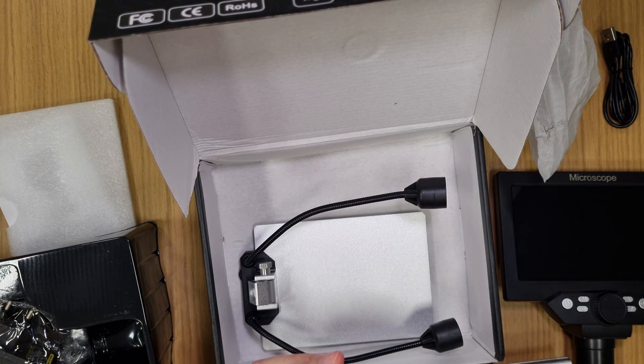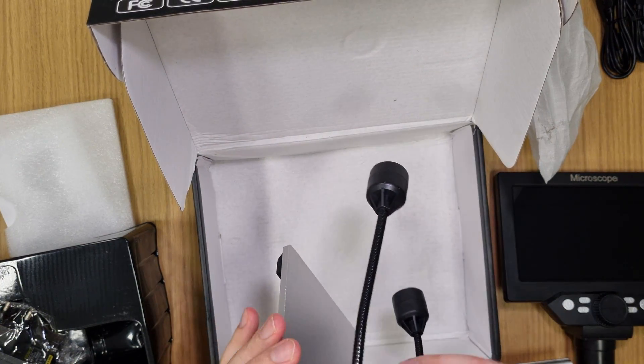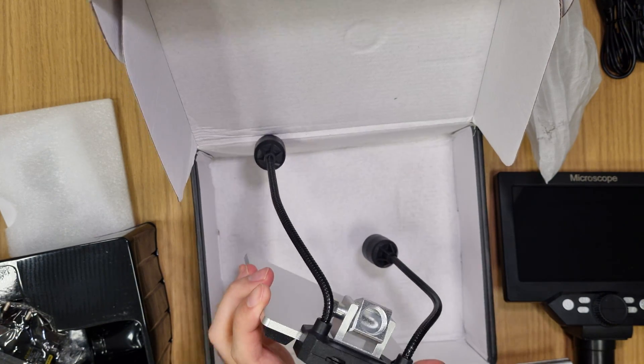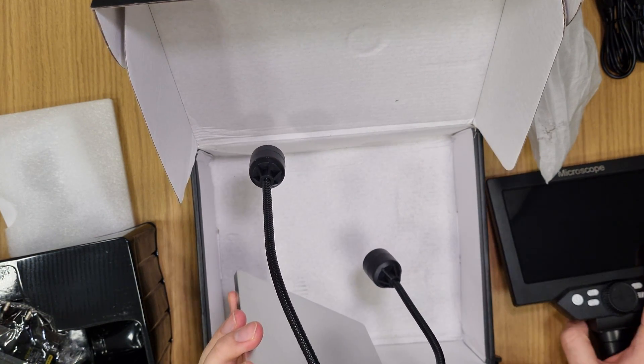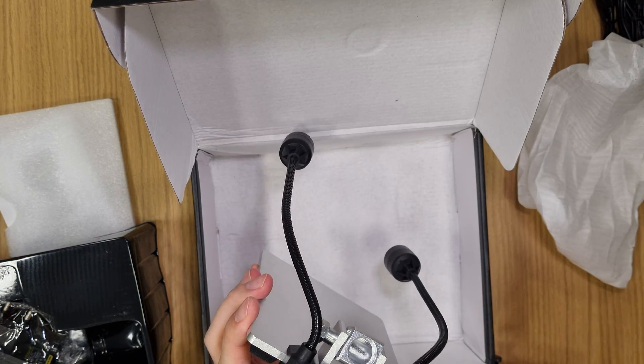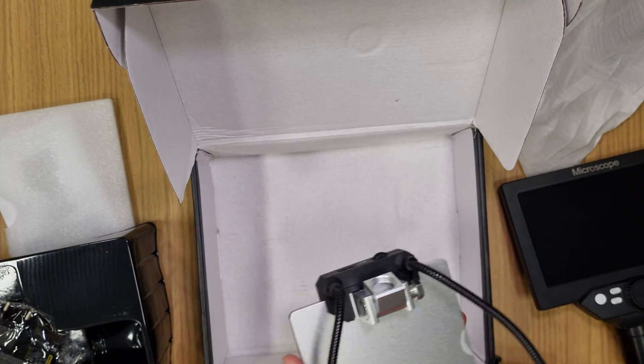There are actually two micro USB cables included — I'd rather have one good one instead of two. There are also USB ports and a USB Type-B port, which is interesting. That's everything in the box.